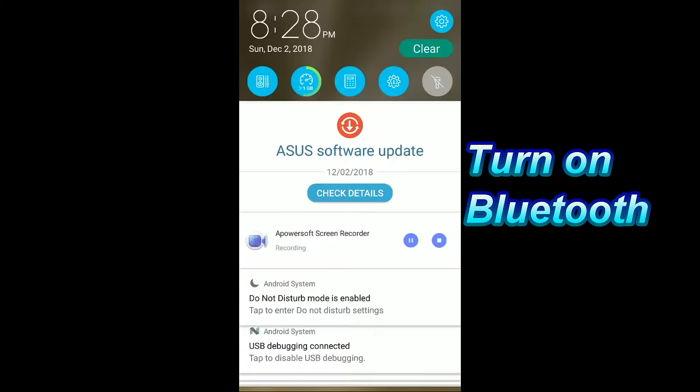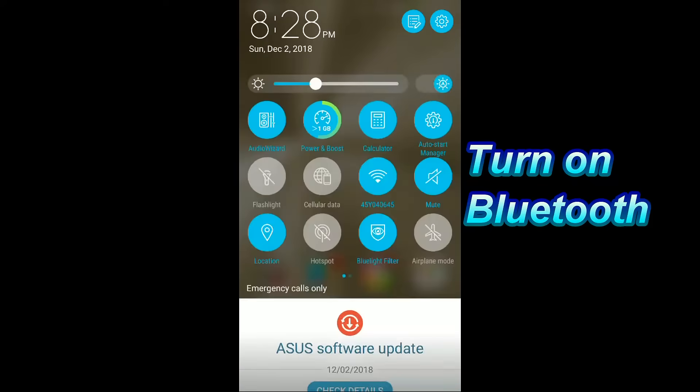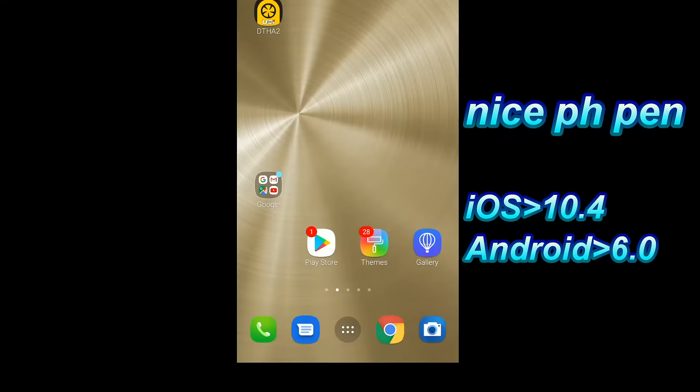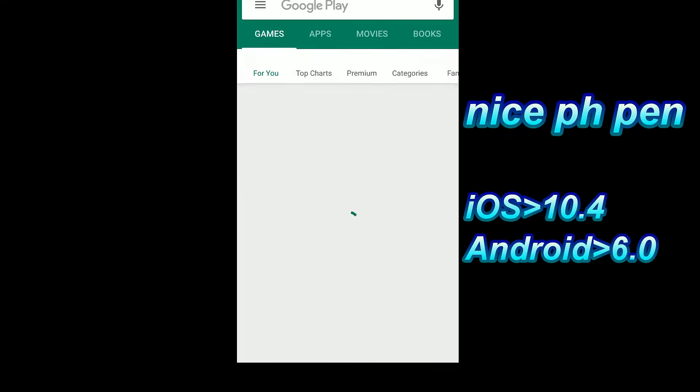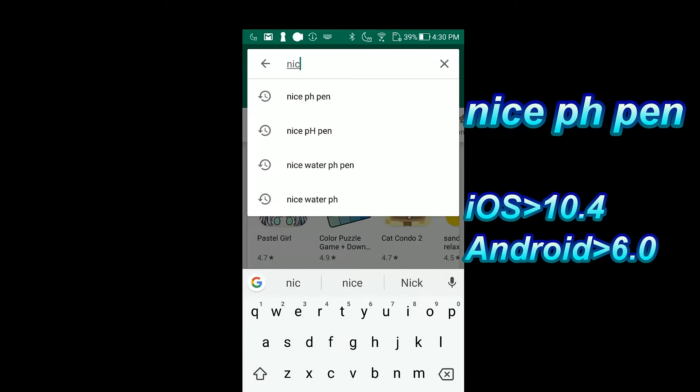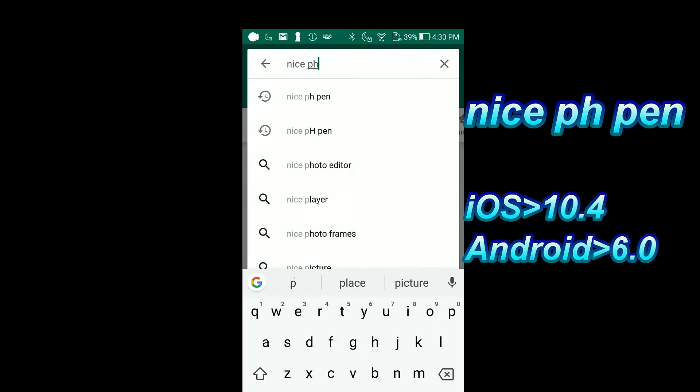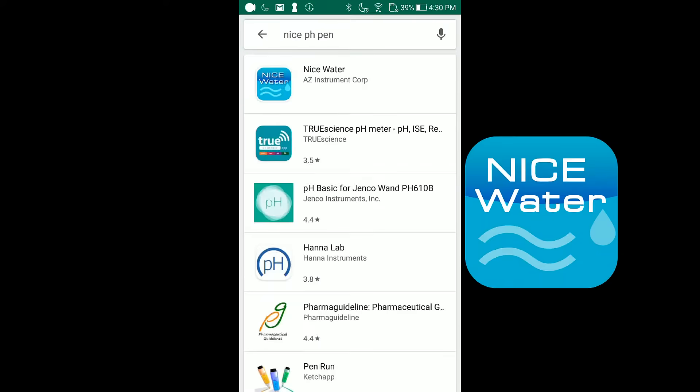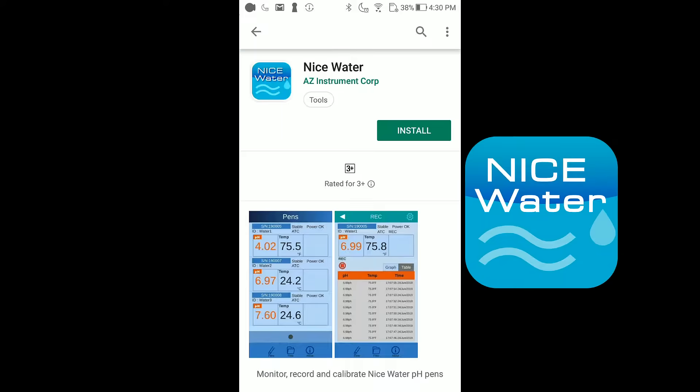The first step is to activate the Bluetooth of your smart device. Search for Nice PH Pen on App Store which is free. Install the Nice Water app.